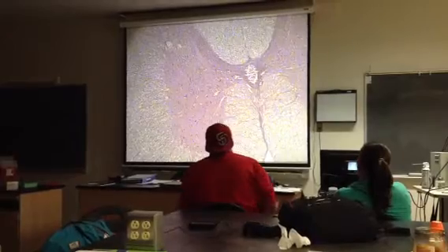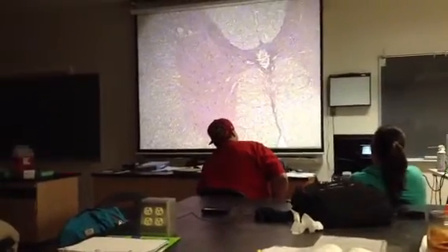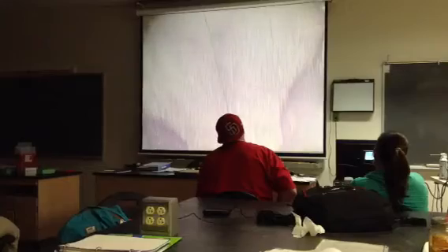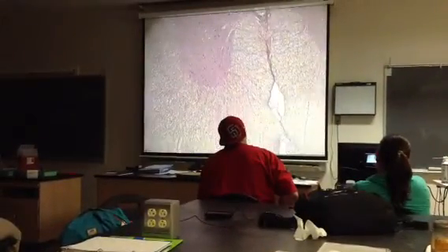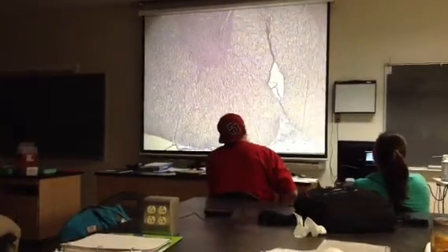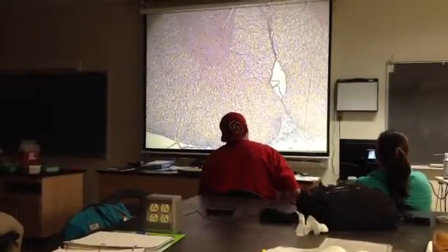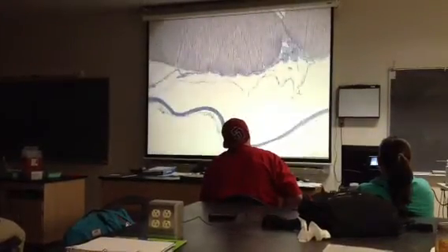What's that opening, that circular? Central canal. That's the central canal. Yeah, and so if we look there and we see this, and then we compare and go to the other side. Okay, what looks like more of a space or groove? That's the anterior fissure. Yeah, this one here, so this must be the anterior side, because here's the fissure. It's a little separated apart right there. Just happens in these sections, things sometimes fall apart.